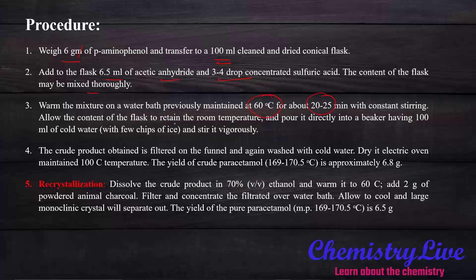Allow the flask to reach room temperature and pour it directly into a beaker with 100 ml of cold water with a few chips of ice and stir vigorously. The crude product is obtained by filtering on the funnel and washing with cold water to remove excess acetic acid. Dry it in an electric oven at 100 degrees temperature. The crude product yield is 6.8 grams approximately and the melting point is 169 to 170.5 degrees Celsius.